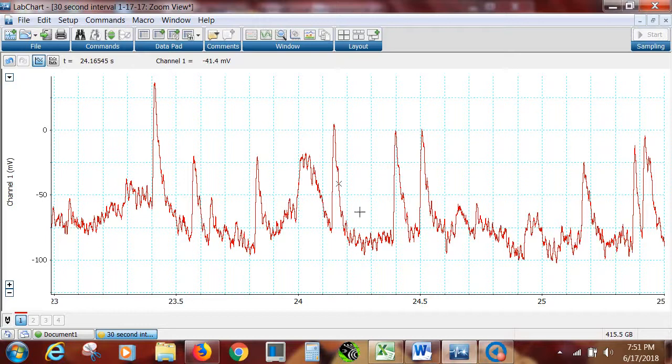Now 24 to 24.5. 1, 2, 3, right on the edge again. I'll count that as 3. Now 24.5 to 25. 1, 2, fast rise, pretty big, but we didn't count it over there. But should we count it here? We could skip it, I guess, but we'll have to do that in all the others. So what do we have? 1, 2, 3. Is this going to be just 3 again? 3, and that's going to go to 25.